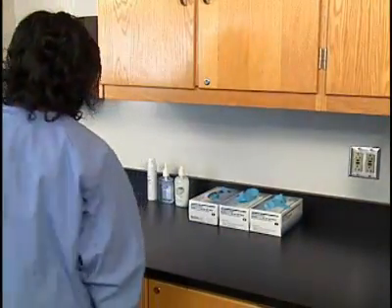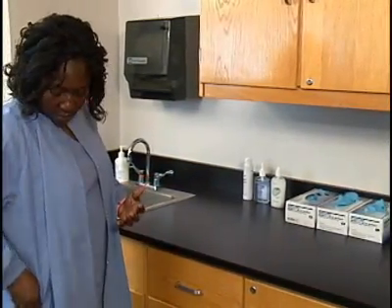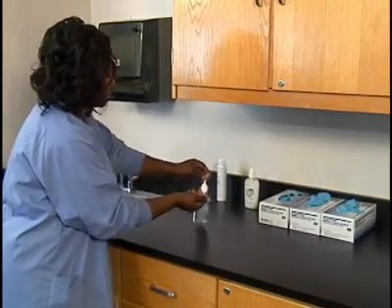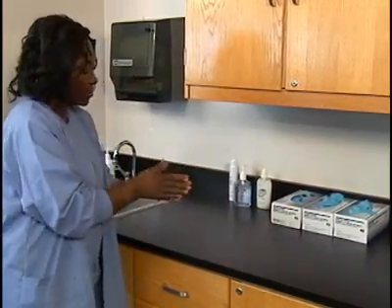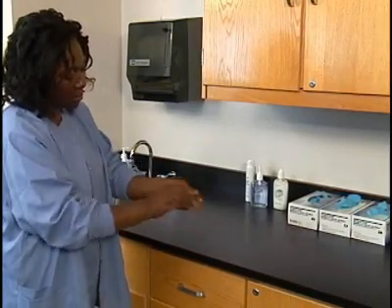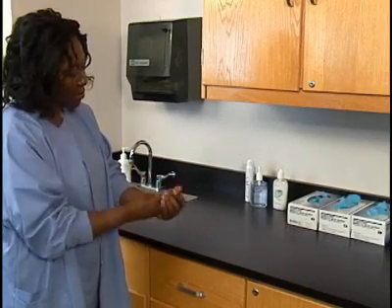Remove your rings and put them in a safe place. Rings can cause tears in your gloves. Sanitize your hands. The warm, dark, moist environment inside of a glove provides ideal growing conditions for microorganisms. Washing your hands or applying a hand rub removes pathogens and prevents their spread.